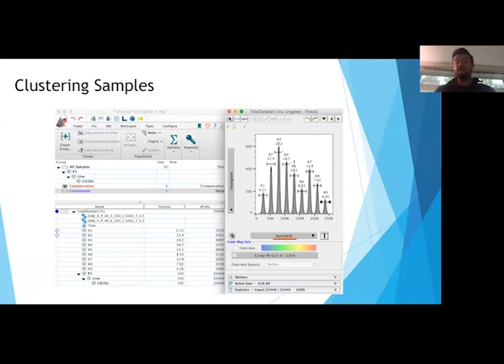Now we can view these parameters in different graph windows, but utilizing the same t-SNE mapping. That can be really handy. If we were to do this in a different order, if we were to run t-SNE on each of these individual samples, we would get a different t-SNE map for every sample. Obviously that's going to make it impossible to compare between the different samples, and that's the whole reason for concatenating the data files ahead of time.